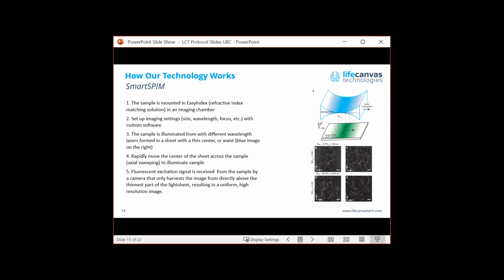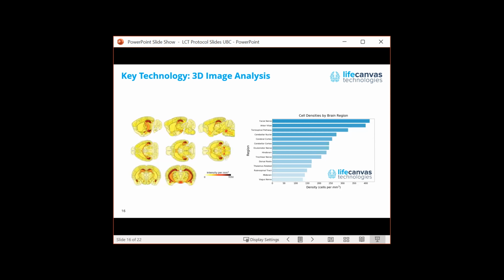And so typically in our CRO services, you can set up a light sheet experiment in 15 minutes to half an hour: focusing, loading in the samples, all that stuff. And then acquisition depends on the size of the sample and the magnification and how many channels. A whole mouse brain at 3 channels takes like 3 or 4 hours if you want to acquire all 3 channels.